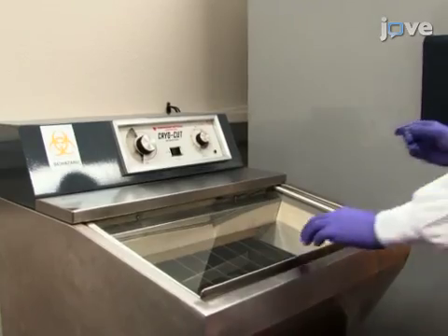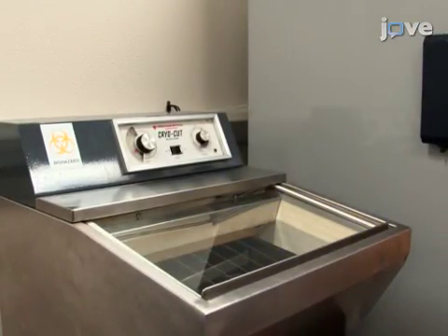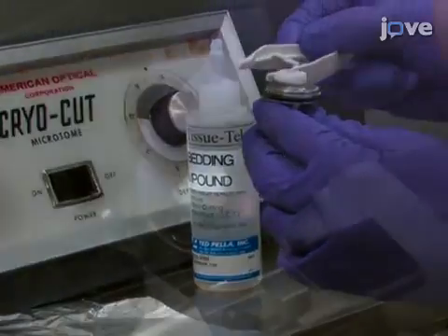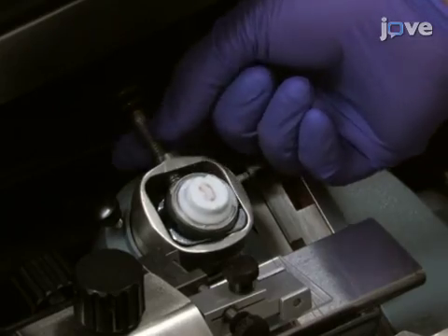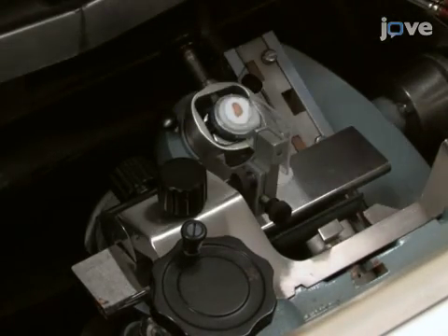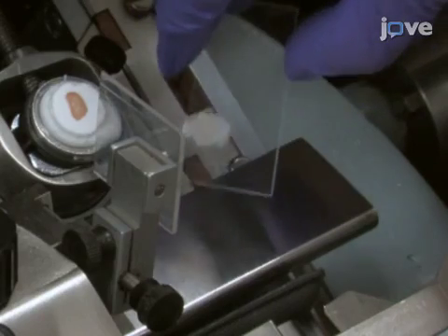To prepare the mouse tissue section, take the frozen mouse organ and thaw at minus 15 degrees Celsius in a temperature-controlled cryomicrotome. Secure the tissue onto a steel base with approximately 500 microliters of tissue embedding compound and place onto a cryomicrotome sectioning mount so that the desired sectioning orientation is presented to the knife. Section the tissue to a 12 micron thickness, then place the sectioned tissue slices onto polycarbonate microscope slides and leave them to dry for 30 minutes at room temperature.